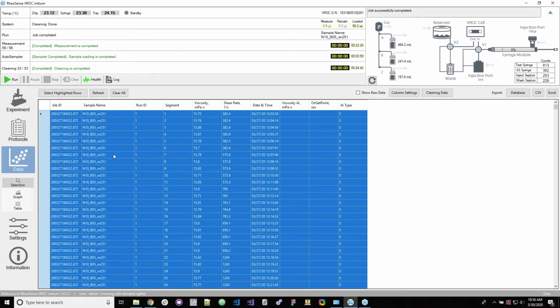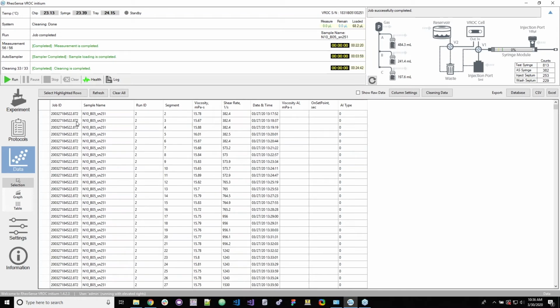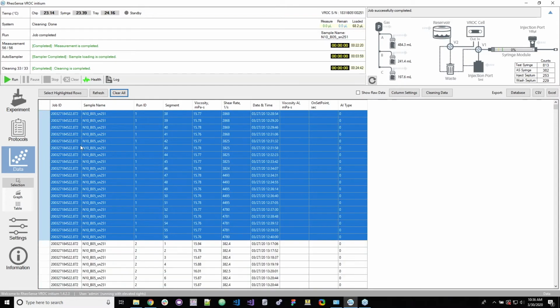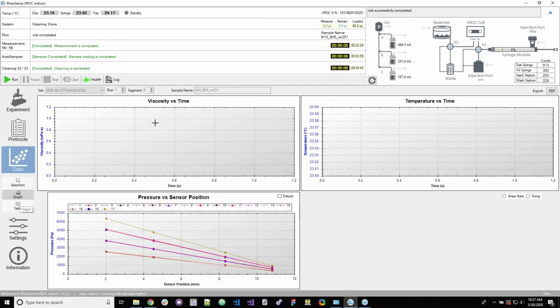So next we have the data tab, which will keep track of all your data. And so you can compare data from the same run, different runs, different jobs, and it keeps track of all of that. So you can, let's say, clear all, and then we want to select the N10 runs. So we have this N10 run, and then hold Shift and click, and it will select both runs of this previous N10 run. You can then select highlighted rows, which will cause it to select that data that you've clicked, and then now it will populate the graph tab.